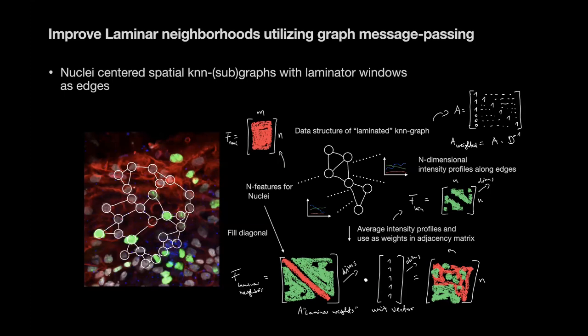So what I now worked on is working more with KNN graphs. So in a tissue, you would have segmented nuclei. You give a certain distance threshold and build these graph structures. And then what people nowadays most often do is they take the information they get from the nuclei, and in order to bring in spatial information, they would average over neighborhoods, or they would do something called message passing in graphs.